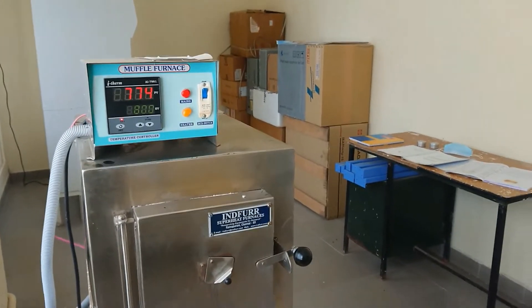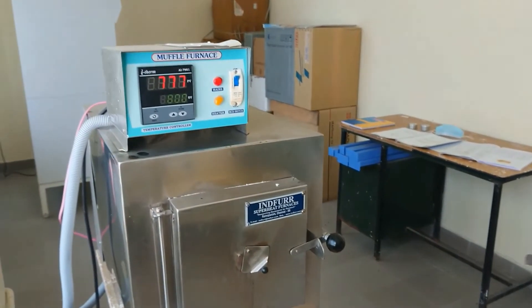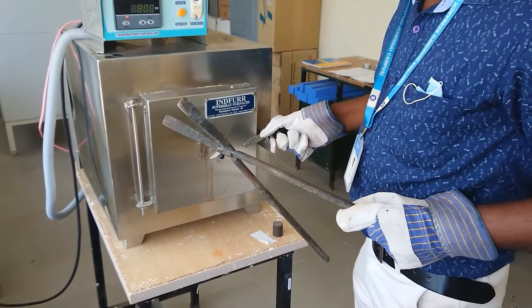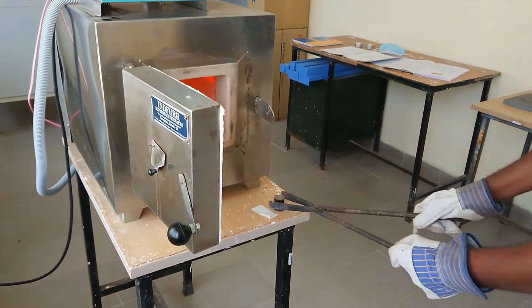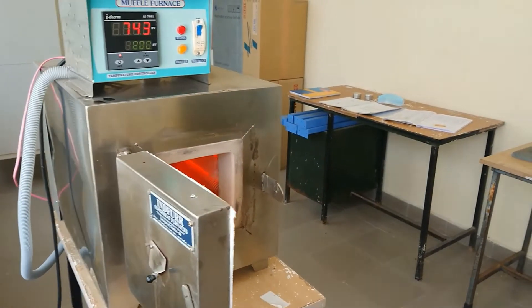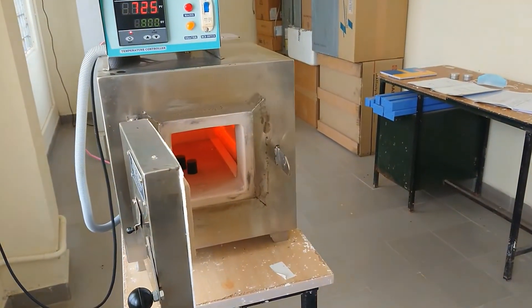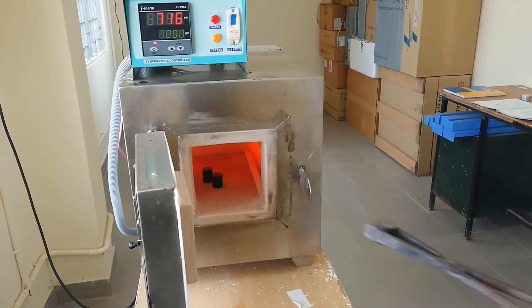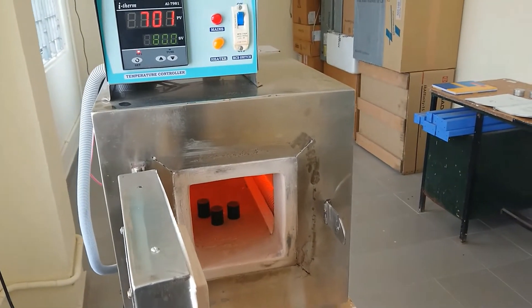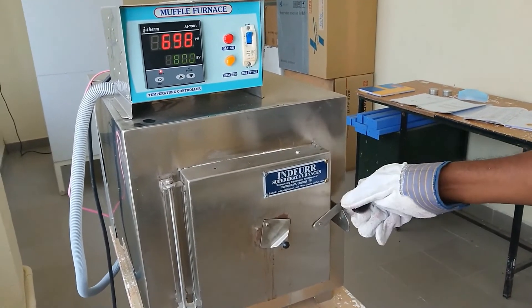Now for the heat treatment process we have to place the materials inside the muffle furnace. Open the muffle furnace and keep the materials inside. You must use gloves, tongs, and all necessary protective equipment. For the three exercises we are taking three materials: annealing, hardening, and normalizing. After placing them inside, close the muffle furnace.